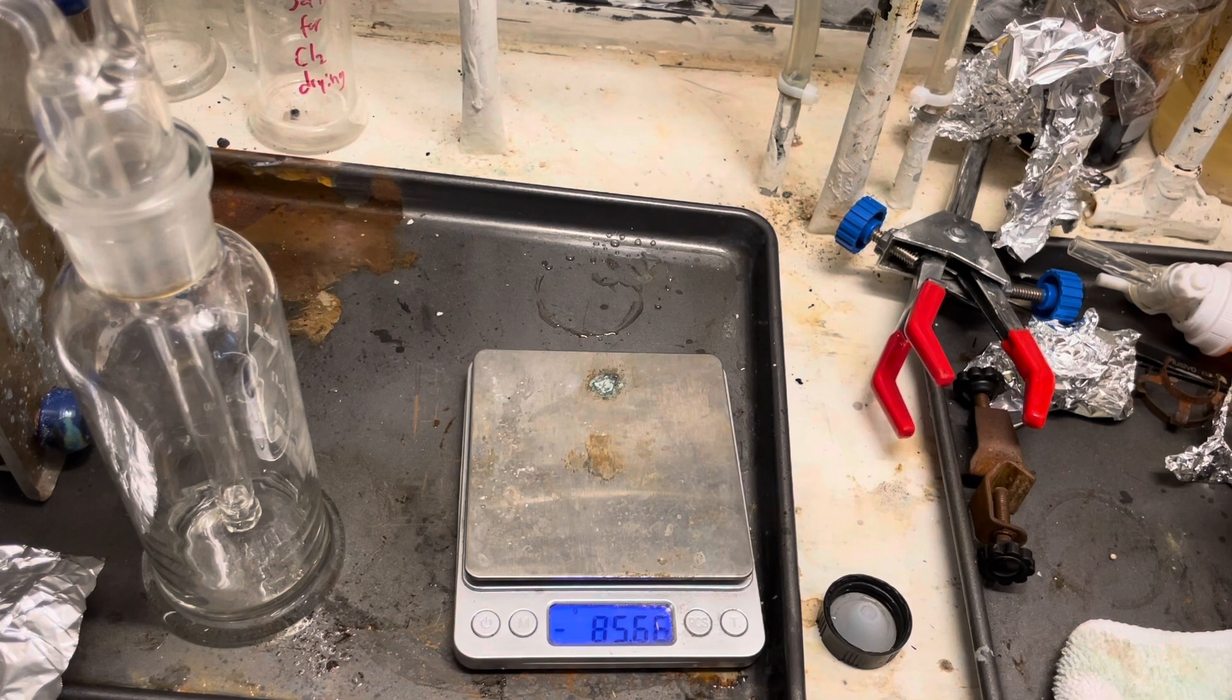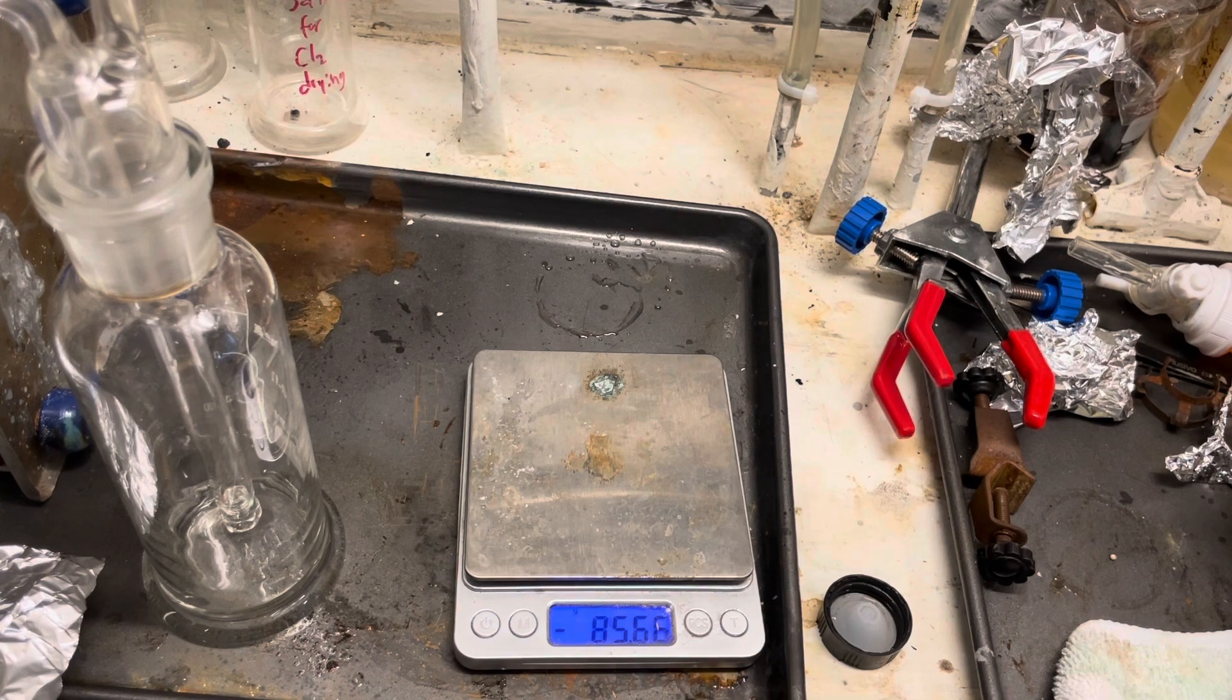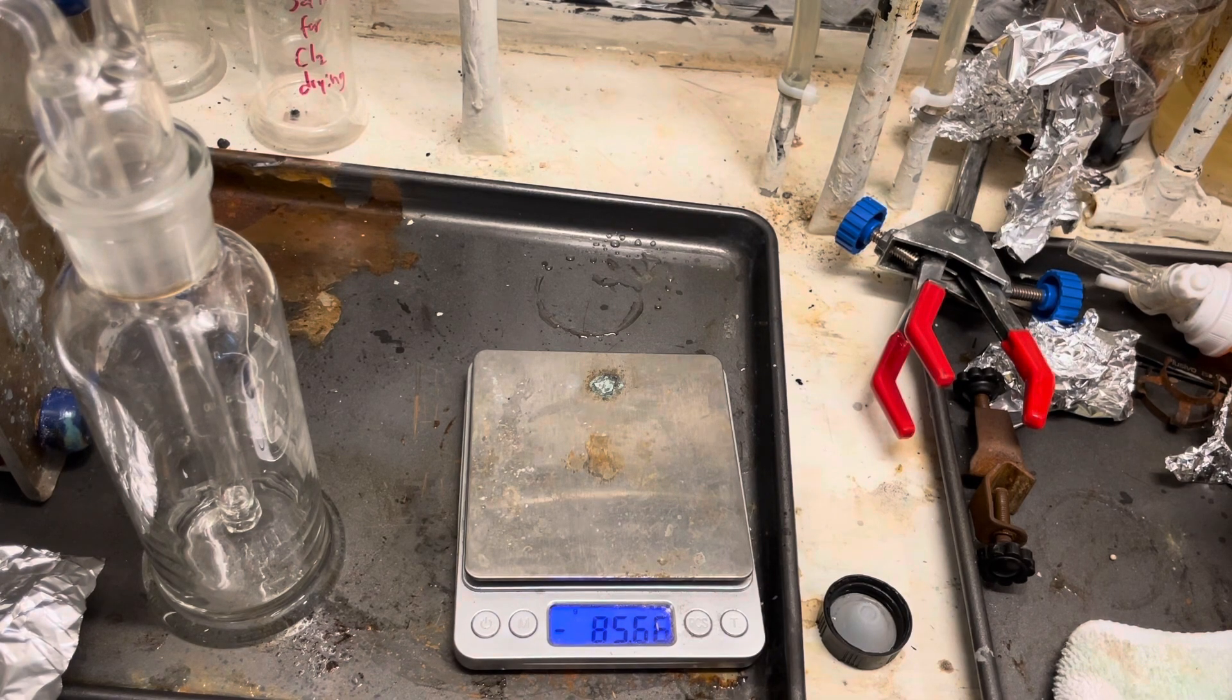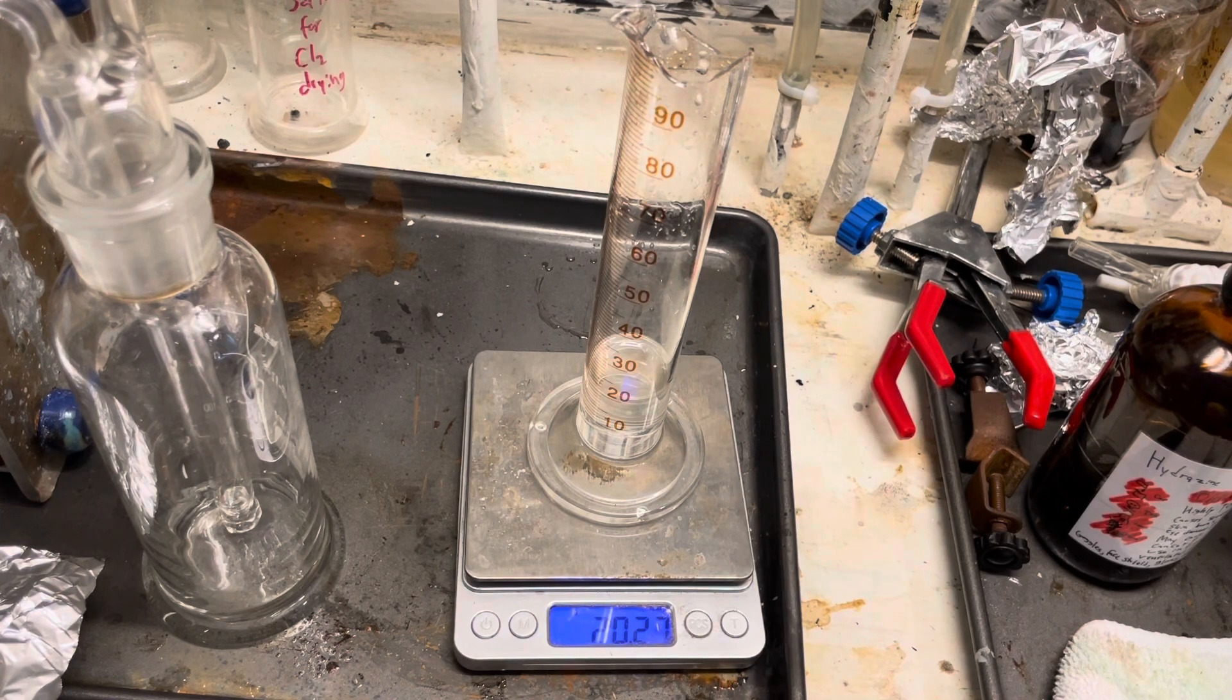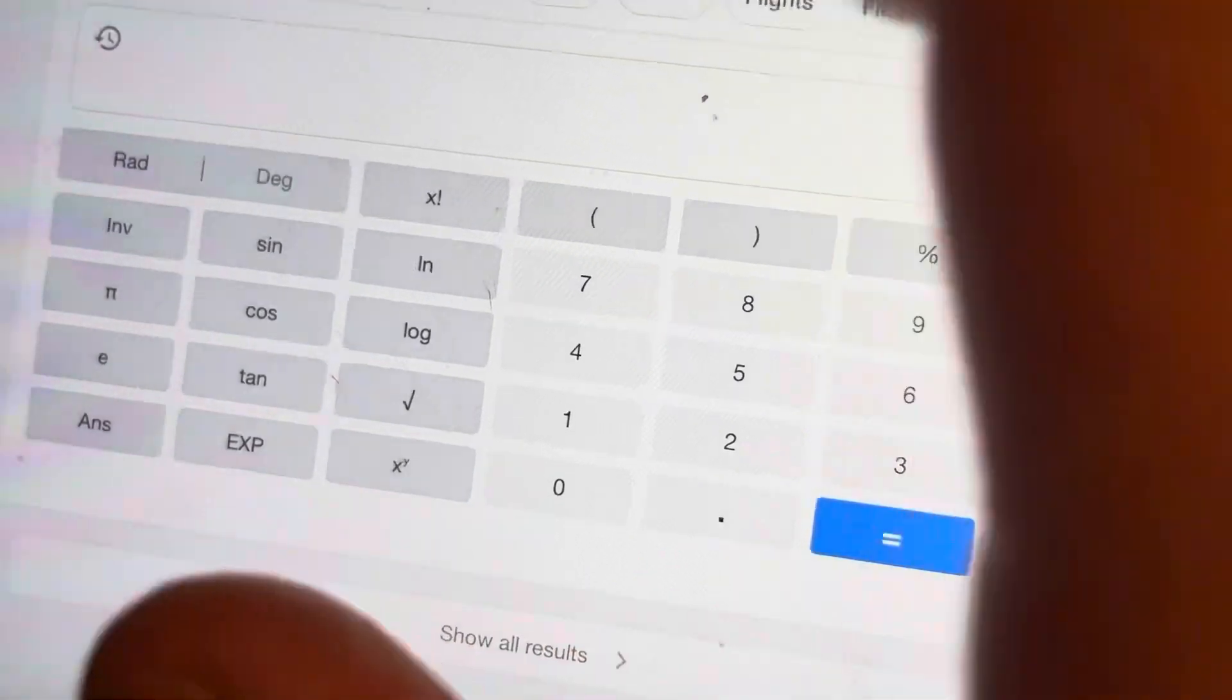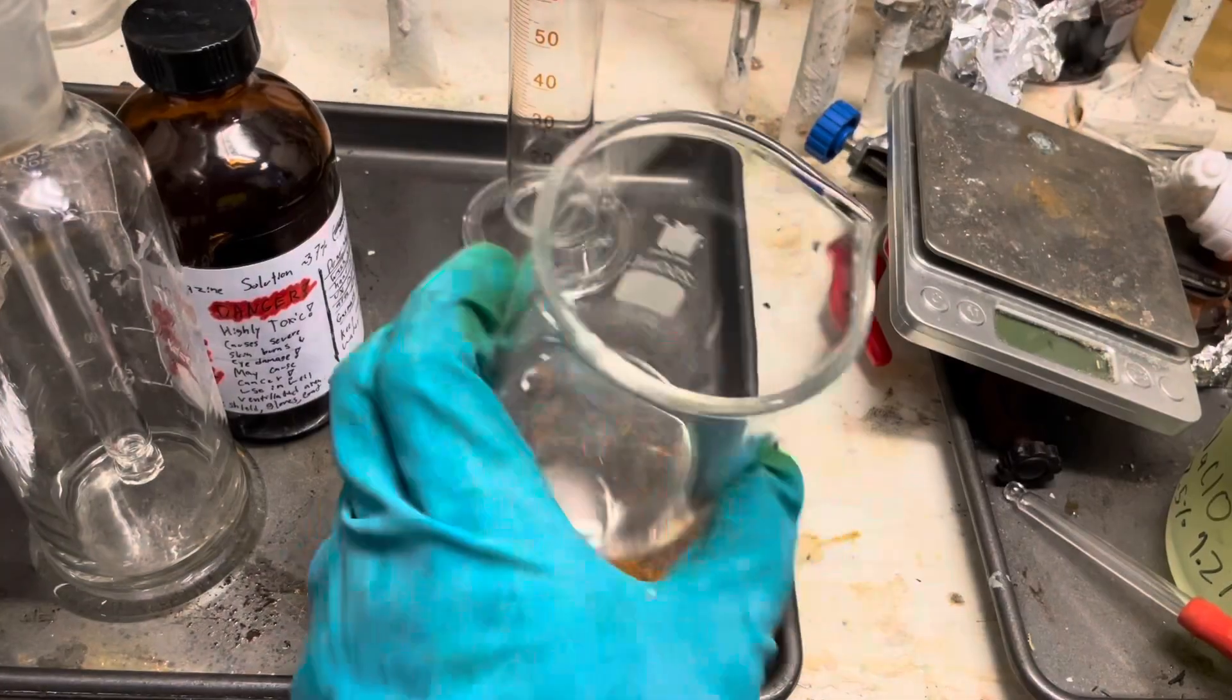I could not find a density chart of aqueous hydrazine online, so all we can do is compare it to a known density. Not exactly great, but oh well. Measured at 20 milliliters, and the density just does not match at all to concentrated hydrazine. So now it's time to titrate it.